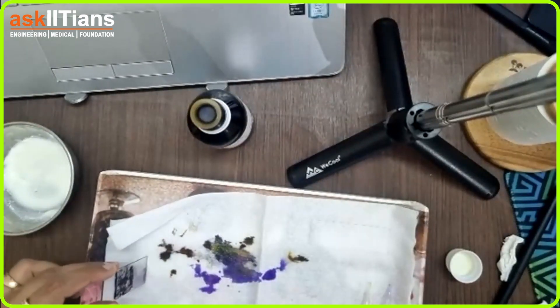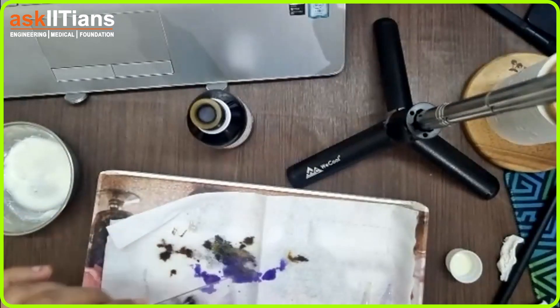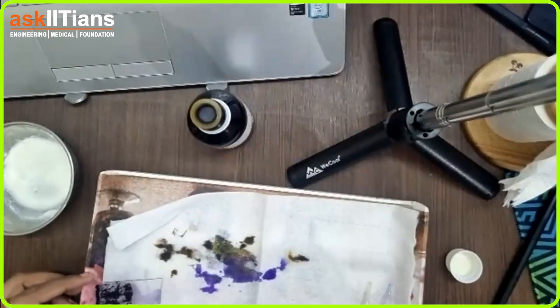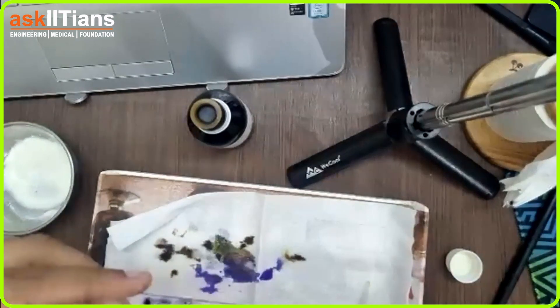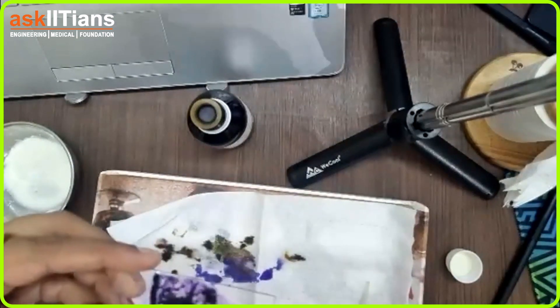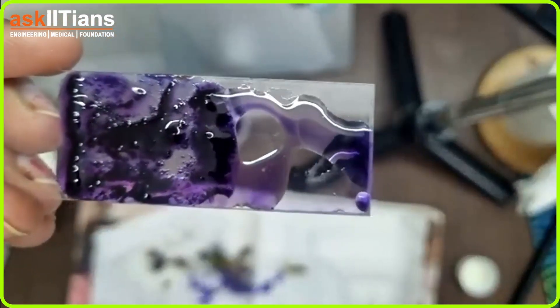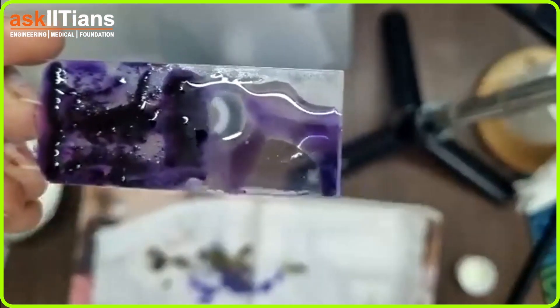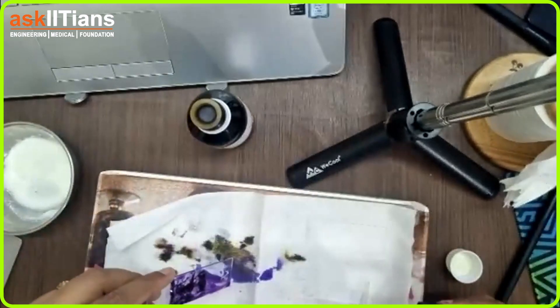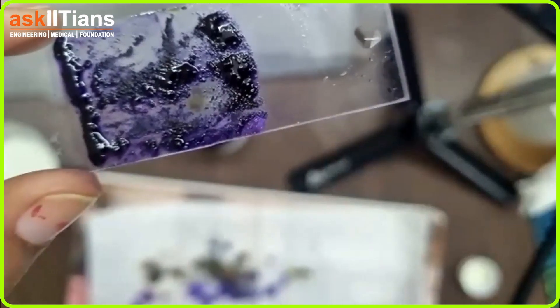Now let's wait a little time for excess water to drain, then we will decolorize it. Let's take alcohol and put it over the slide. As soon as I put alcohol, look what happened — you can see all the chemicals are trying to ooze out. Alcohol is going inside and removing the excess chemical. Let it rest for about 30 seconds until the excess chemical is literally out.